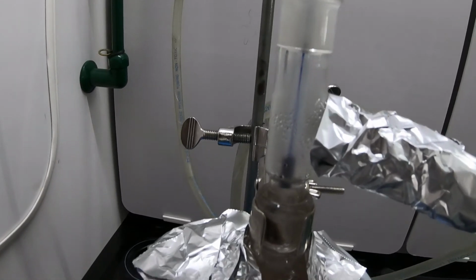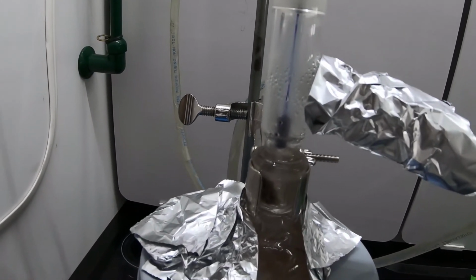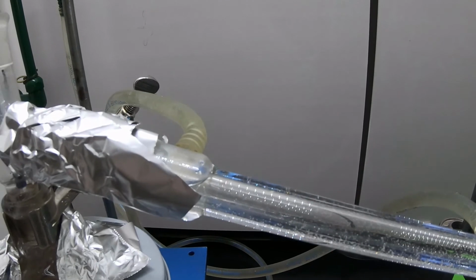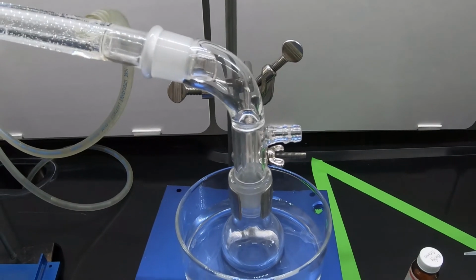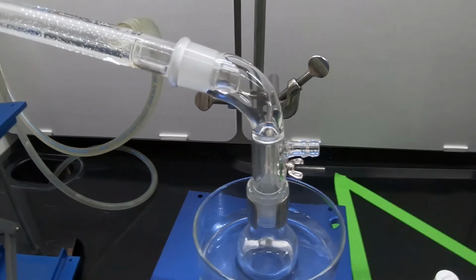We have condensing all the way up the distillation head, and we are starting to see some small amount of condensation inside the condenser. We haven't collected, oh, my apologies, we have just started to collect material in the receiving flask. That's been about, I guess at this point, 13 minutes.